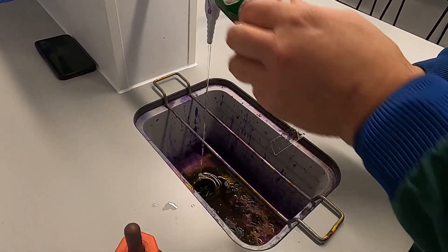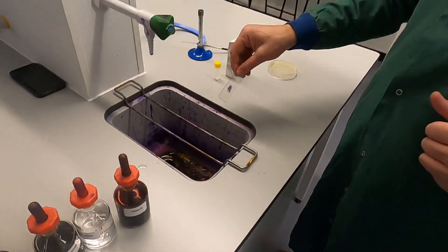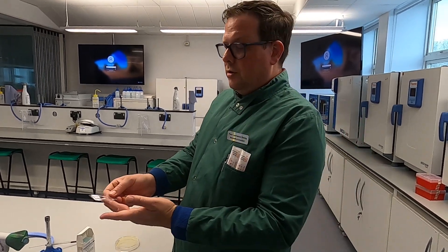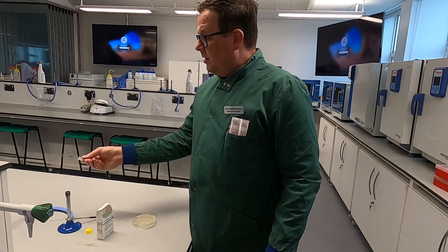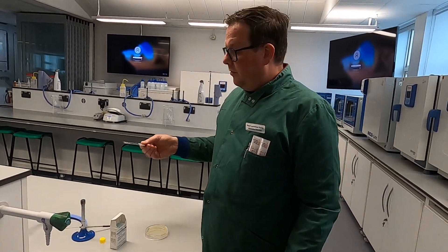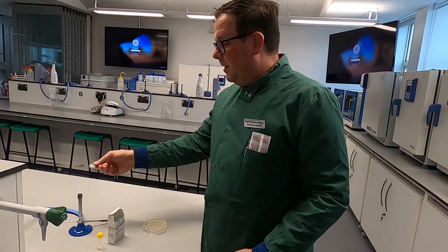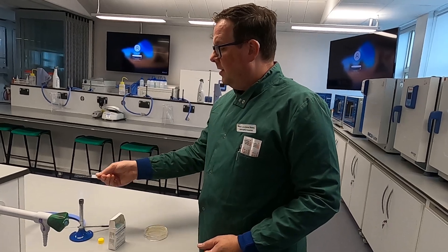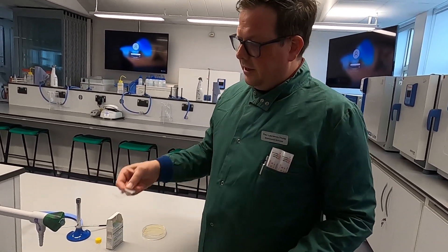And there you have a completed gram stain. Now to view this under a microscope, you do need to dry it off. If you have tissues, you can wipe the back; if you don't, don't worry about it. Then gently pass it through the flame just to dry it off. Do not turn your slide upside down to help it dry or you'll burn the bacteria clean off. Take a few seconds to do that — don't be afraid, you can give it a little flick to help it along.